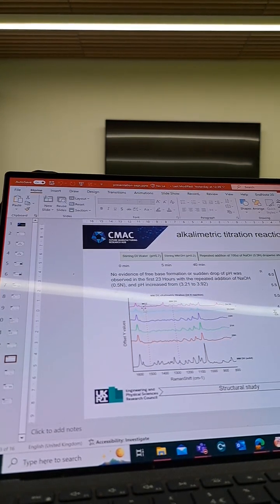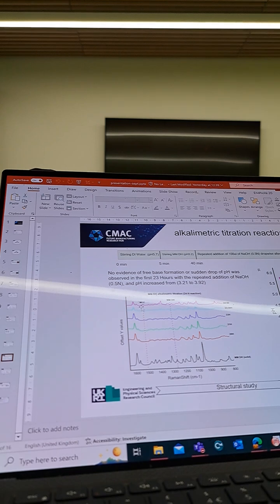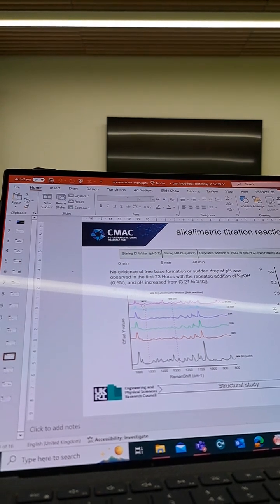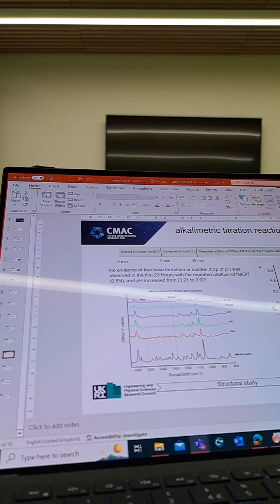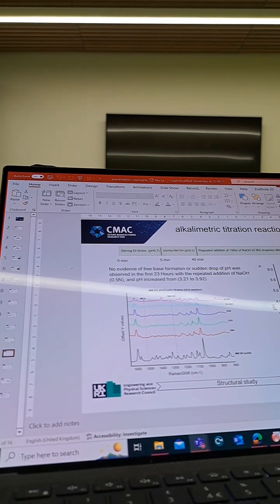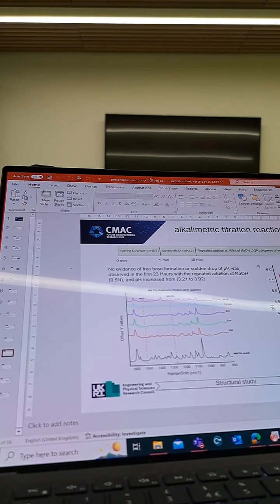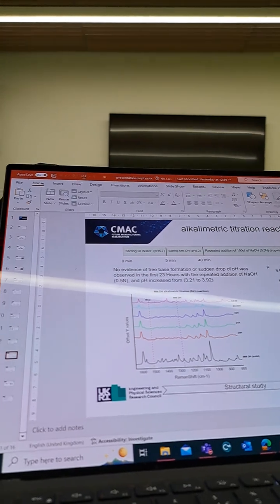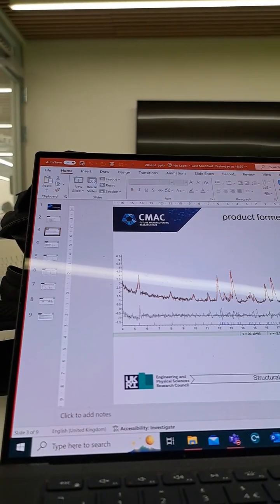So you have a pH measurement for each spectrum? Yes, for all of them. So it would be the same procedure as integrating the peak as before. In spectrograph, you can cut your region of interest. If you can just show me once, then I will do it. For the rest, I don't remember how to.